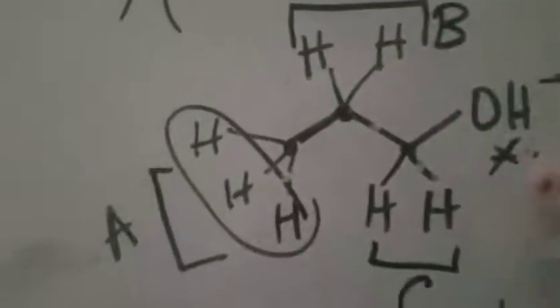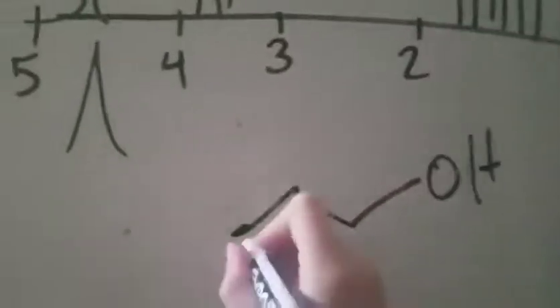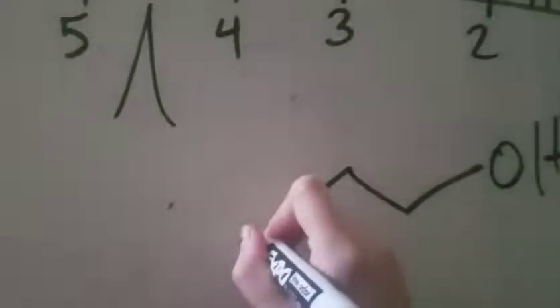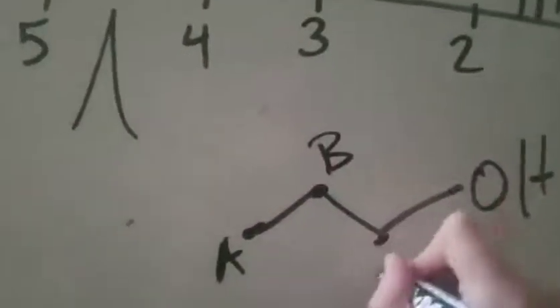If we were to do carbon NMR, we'd do the same thing, only I would label all of my carbons. So that's what I like to do. First, start off, go ahead and label what you have and just give it a peak assignment. And then you're going to go through and try and do your best to label everything. So this is a carbon here, so I'll say this is A, this is a carbon here, this is B, this is C, okay?